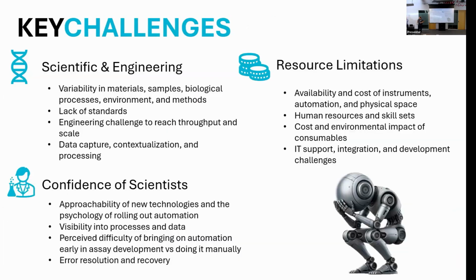Key challenges here, of course: nothing's ever as easy as it should be. Scientific and engineering challenges. Biology is fuzzy. There are often scenarios where there's variability in materials, samples, and processes. It's often difficult to quantify exactly what you're doing. There's a lack of standards in the industry, and that's a huge area that really needs to be solved. And then there are just general engineering challenges: capturing all of that data, managing throughput, staffing.